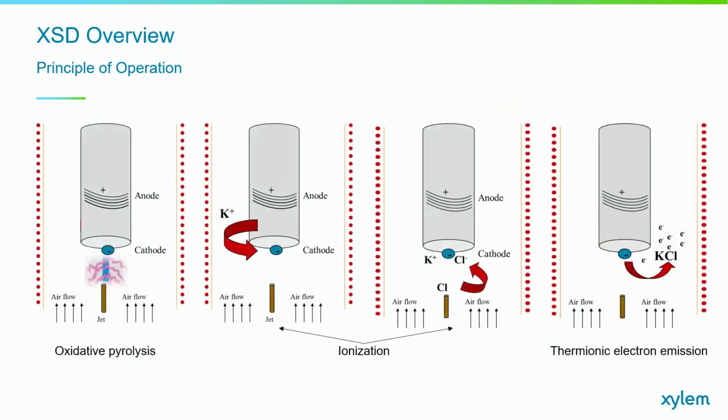And here it is one final time in all its steps: pyrolyzing, converting them to halogen atoms. They're reacting, they're accumulating on an alkali monolayer cathode. Then they're being released due to the heat of that reaction, and the current is measured.